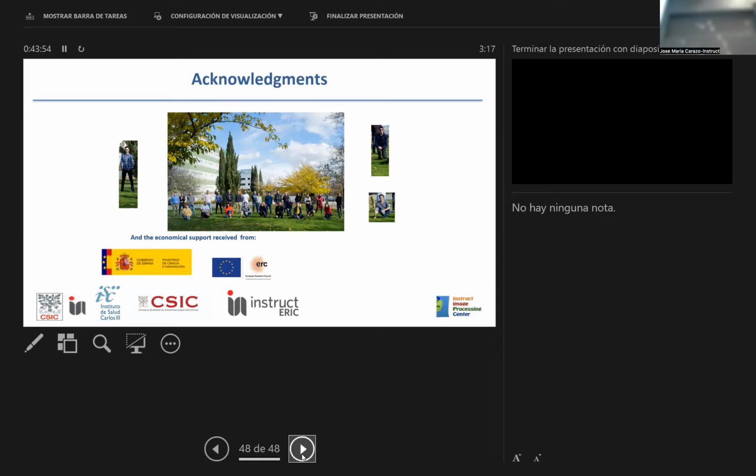Well, UMAP is another representation, as you know. Sometimes it is better, sometimes it is worse than PCA. Sometimes the UMAP maps look like abstract painting. We cannot do much with them, and then we resort to the PCA analysis, because there we understand it's more linear.